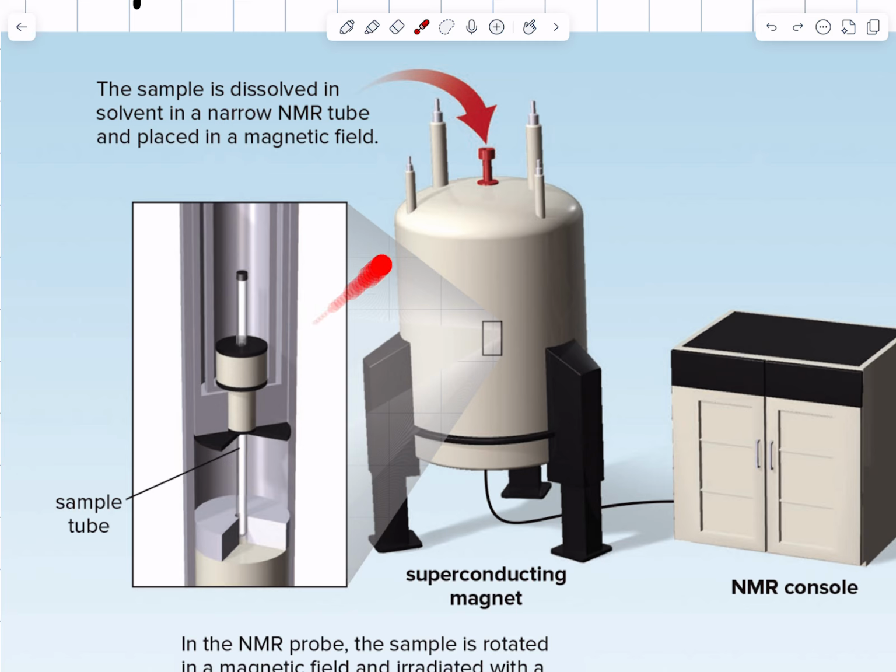You put that sample down a tube in this thing that looks like R2-D2 married a moisture evaporator from Tatooine and they had offspring. And what this is, is a superconducting magnet. There are lots and lots of coils of metal wrapped really tightly inside this that you charge with a current, and when current goes through coils, you generate a magnetic field, right?